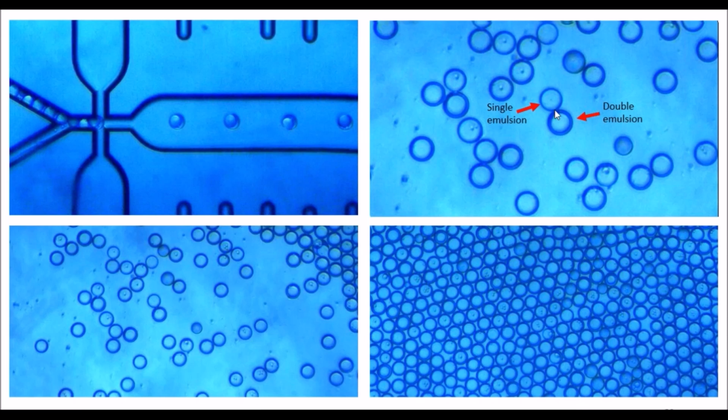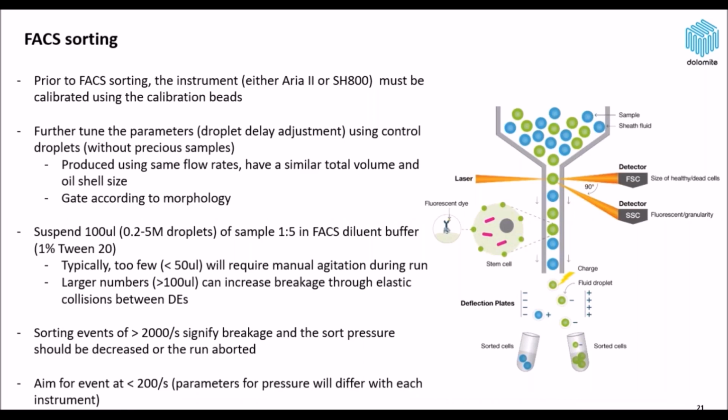So finally, when it comes to when you've collected your emulsion and you're ready to FACS sort, there are just a number of things we usually recommend. We are not essentially the experts.